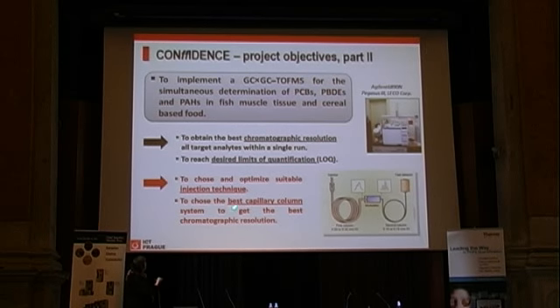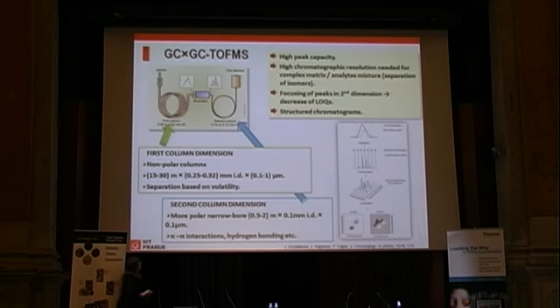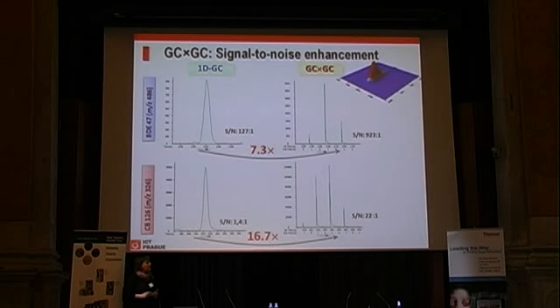And this is what you have to do. You have to think about different setups, and you have to optimize a lot of parameters. It takes really a lot of effort. In any case, this is somehow rewarding. As shown here, if you combine two orthogonal columns together, you can see a really substantial improvement of your detection limit. And the cause is that during the transfer of your effluent from one column to the other, cryocompression occurs, and your peak becomes narrower again. Depending on the compound, but let's say by one order of magnitude, the compressed peak shows a better signal-to-noise ratio. So that is the outcome of your effort to work in GC×GC.